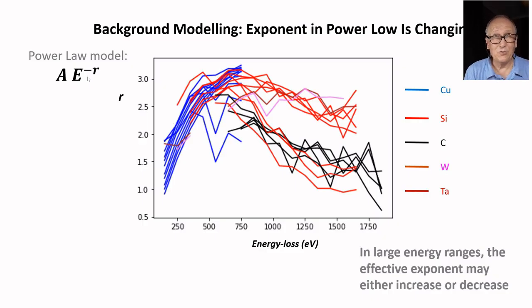But when we start to increase our fitting regions, we find that the exponent R is not constant.